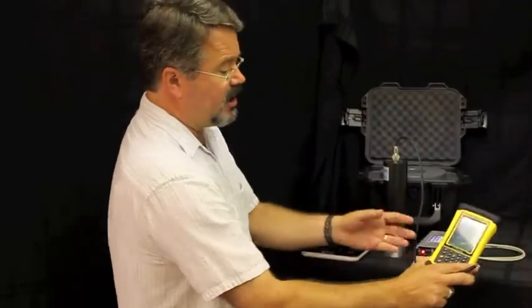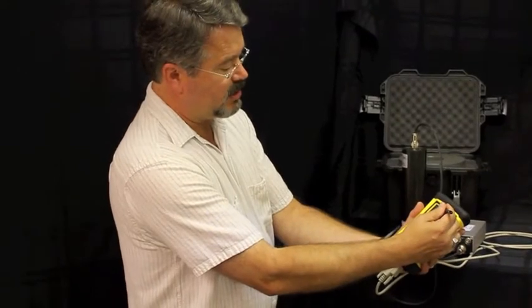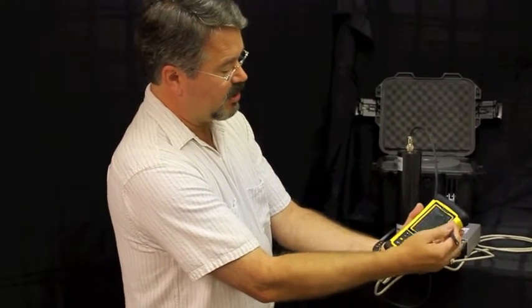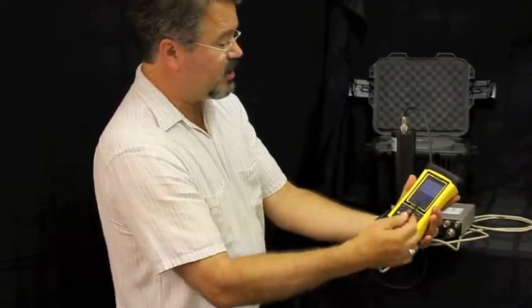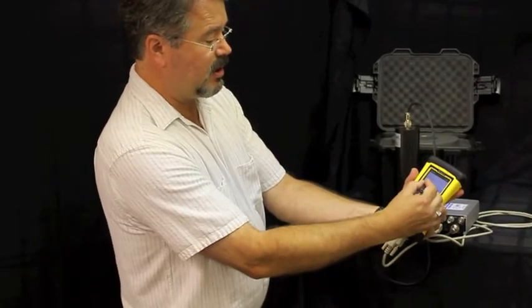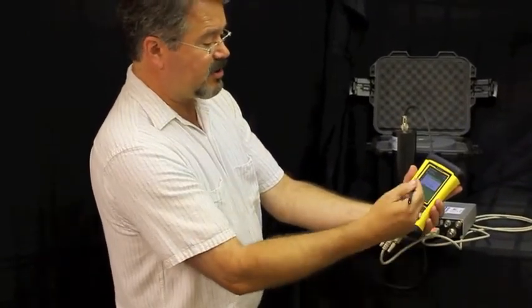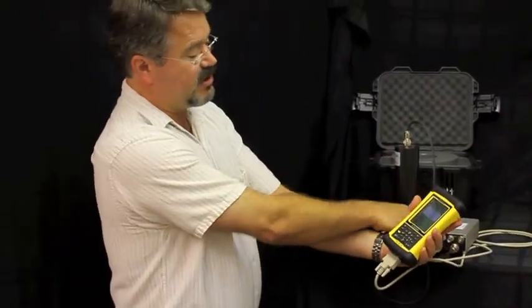Once we have power to the multi-channel analyzer and we're able to communicate with the mobile device, we will select from the start menu the Food Safe application which is already loaded. It will tell us which communication port we're going to use. Most of this is predetermined and default. It's already recognized that the Food Safe device is here and is confirming that with a serial number reading back from this device.